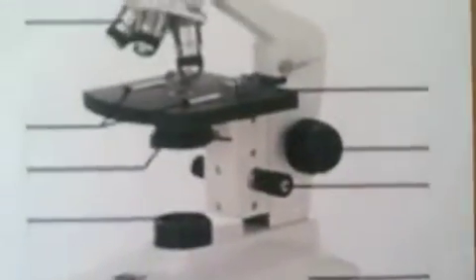And here are the two knobs. Here is the course adjustment knob, which moves the stage up and down for focusing, and that is only used with the scanning power. When you use the compound light microscope, you always start with the scanning power and get it focused with the course adjustment knob.